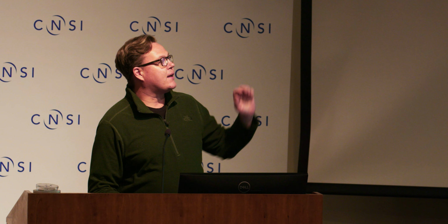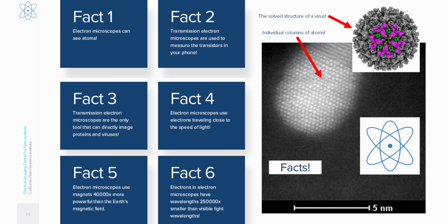They actually have data banks of proteins and various other structures that they've identified that they use for the study of drug development. An example of an image of a virus is shown here up at the upper right corner, and you can see all the different spike proteins on top of this virus, and it's been colorized here. They're all actually not a particular color, but it's been colorized here to see the different features within that virus.